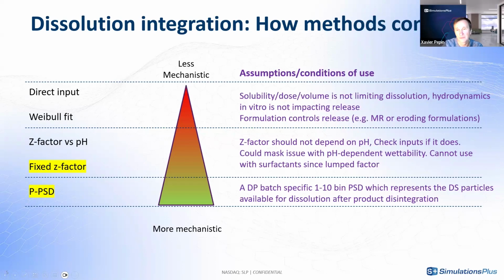And it could be, for example, because your excipient has pH dependent wettability or dissolution.